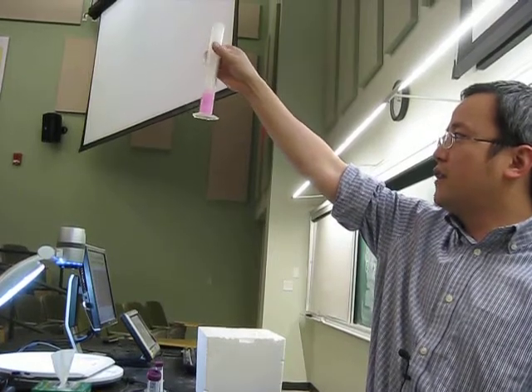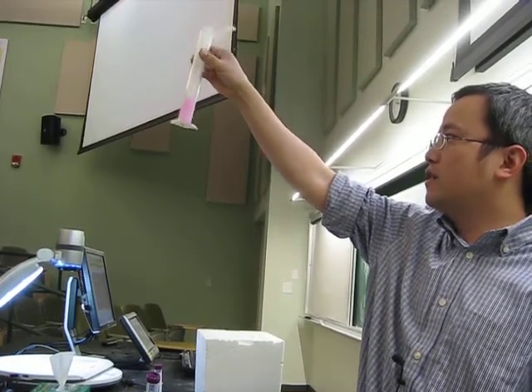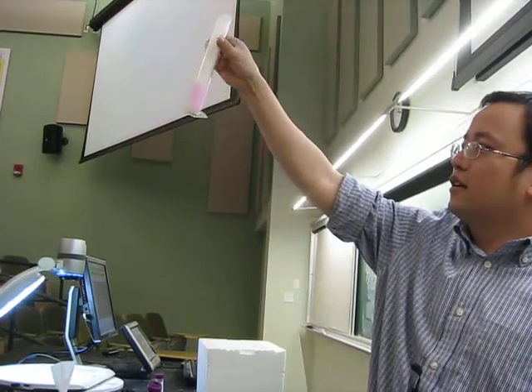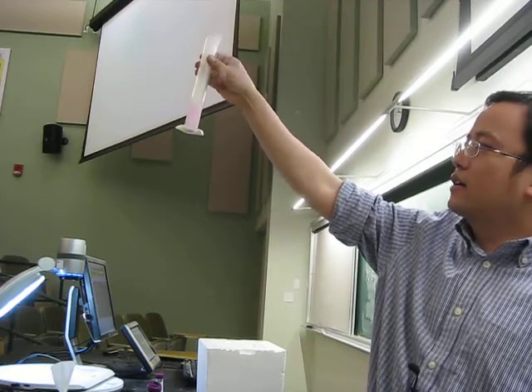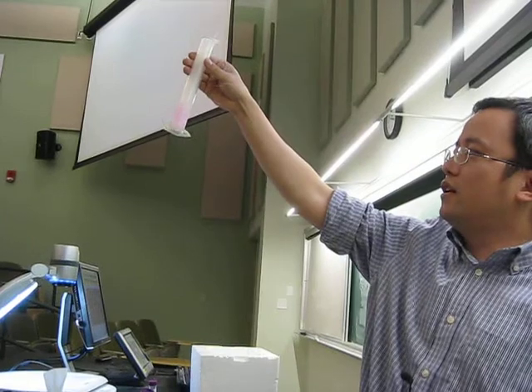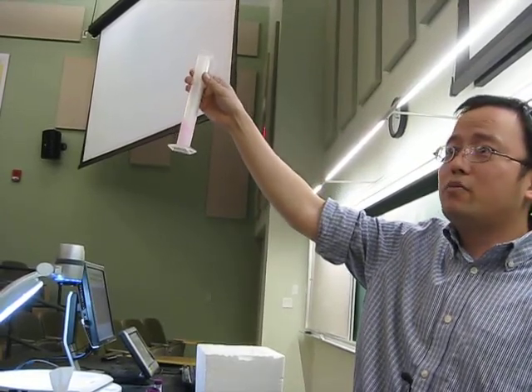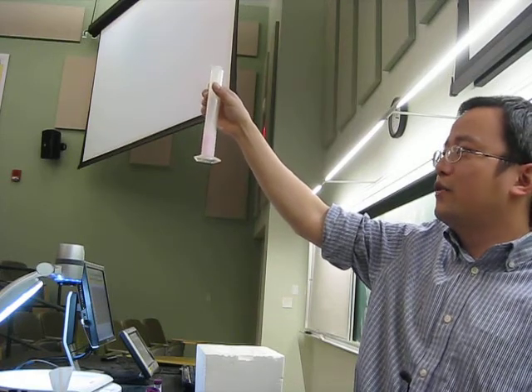Okay, and now it becomes pink. And if you wait enough, longer time, see, what's the color right now? Well, still whitish pink, I would say. Okay, and then if you wait for even longer time, the bubble is, well, first of all, let me ask, what is the bubble? Why is there a bubble? Why is there a bubble?